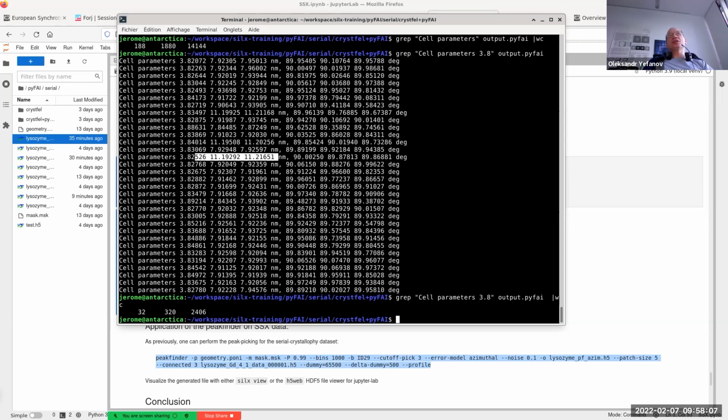And there are suggestions. Tom just recently released CrystFEL GUI. That's quite a nice GUI for optimization of parameters, and he also released a tutorial for this GUI. So if you really want to compare some results, try to use this GUI and look at the tutorial, where he explains step by step what has to be done to process data.